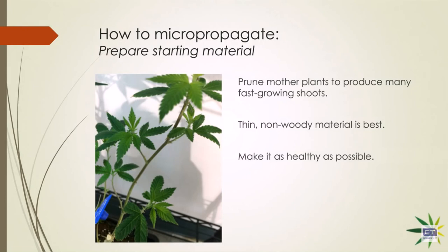You eat food, but it's ultimately turned into sugar. Plants photosynthesize to make sugars. When you remove all their leaves, you remove their ability to do that. So for a while they're small and in this encapsulated state that you see in this figure that I've reused here, you've got to feed them some external carbon. That's in the form of sugar. That's useful. It's a good, efficient food source. It gets them started. They can unfurl their own leaves and begin making their own food.